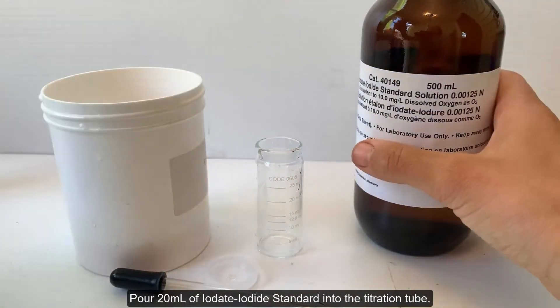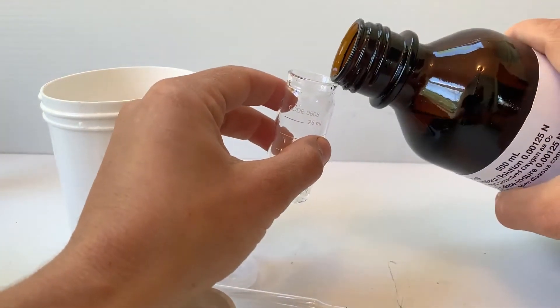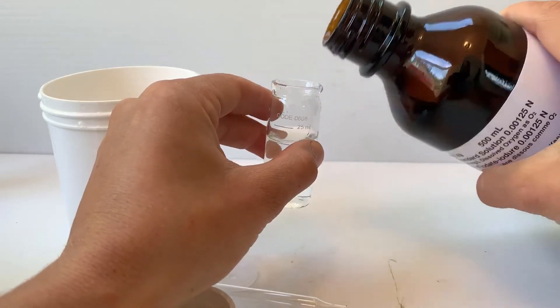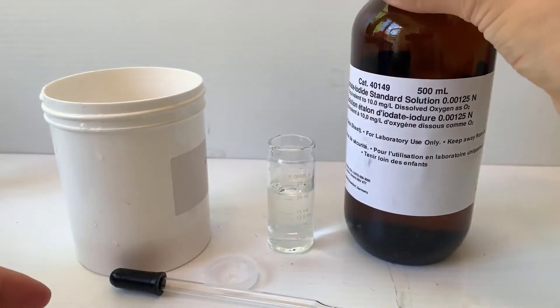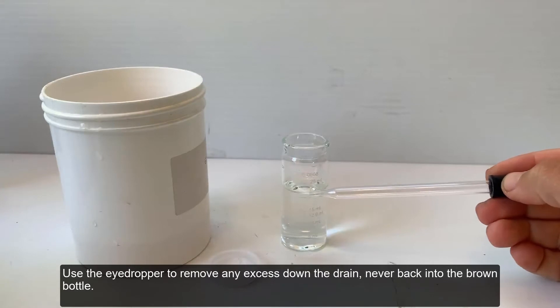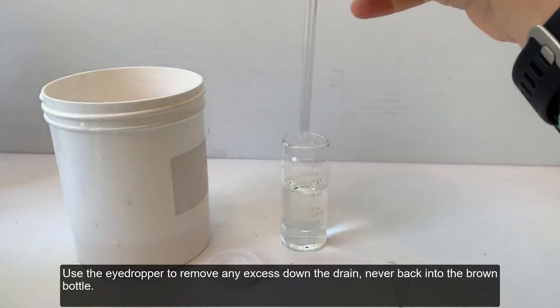Pour 20 ml of iodate-iodide standard into the titration tube. Rest the tube on a table and get down to eye level to make sure the bottom of the meniscus, or curve, is on top of the 20 ml line. Use the eyedropper to remove any excess down the drain — never back into the brown bottle.